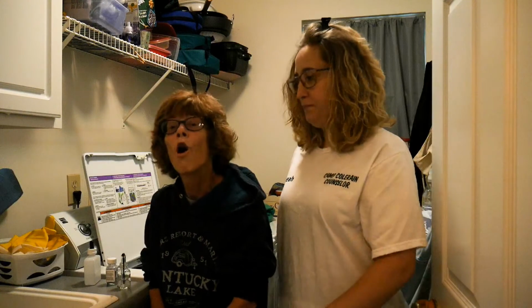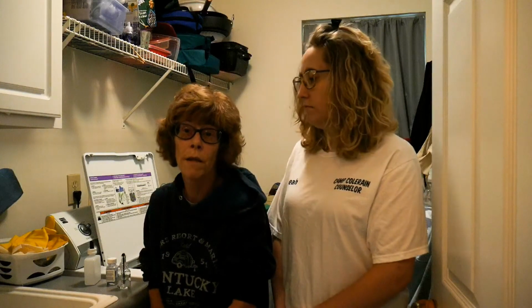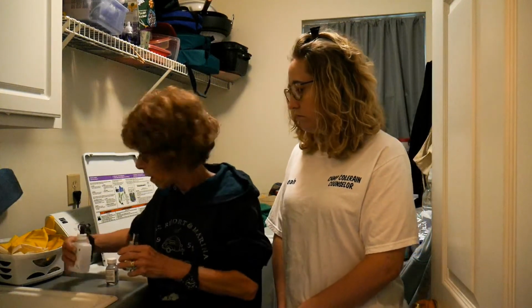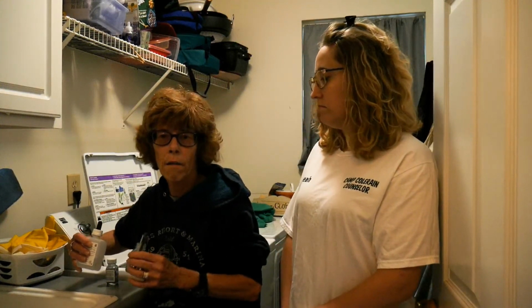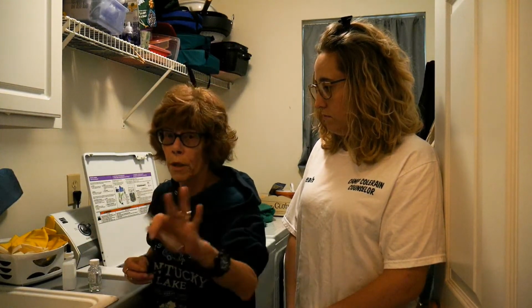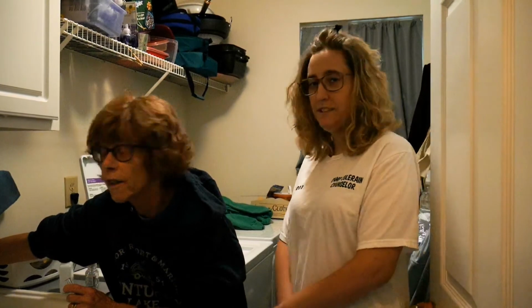So go ahead. Okay, in our lab what they do is we have people that tell us what the hardness they want. It usually ranges from anywhere from 3 grains to 12 grains. This is a water kit you can buy at Lowe's, Home Depot, or any hardware store. We are normally told what we put in, but I don't know what our water is. So that's why we're going to test it out.